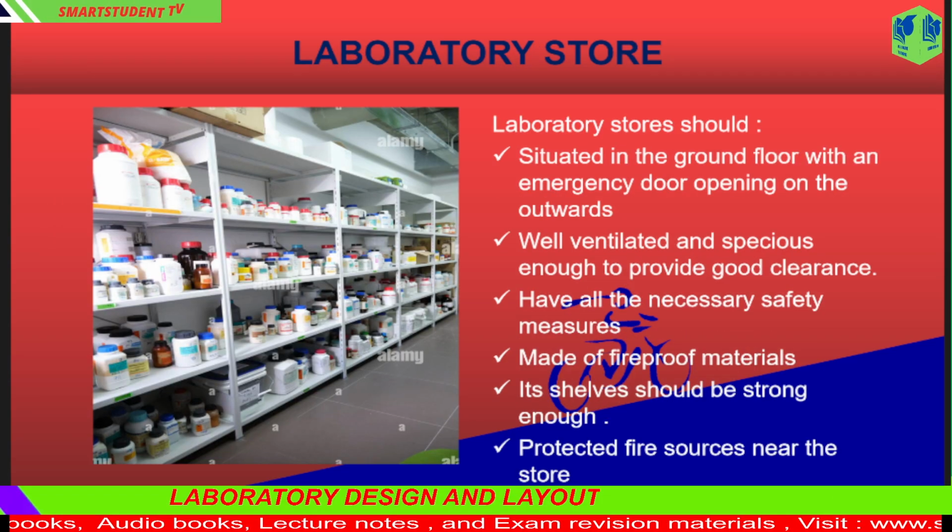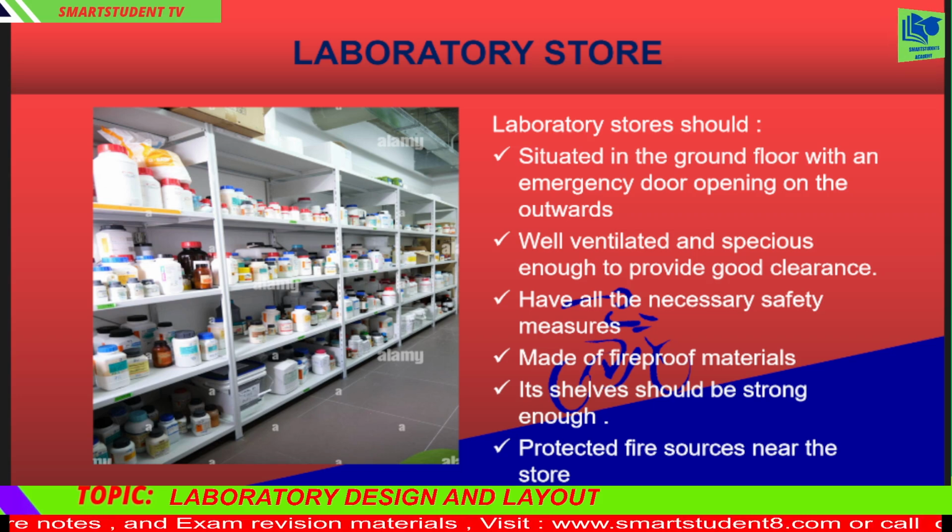A laboratory store is an important room within the lab specially designed for storing apparatus, chemicals, and equipment. Laboratory stores should 1. Be situated in the ground floor with an emergency door opening outwards. 2. Be well ventilated and spacious enough to provide good clearance. 3. Have all the necessary safety measures put in place, e.g. fire extinguishers, shower rooms, protective clothing, and first aid facilities.